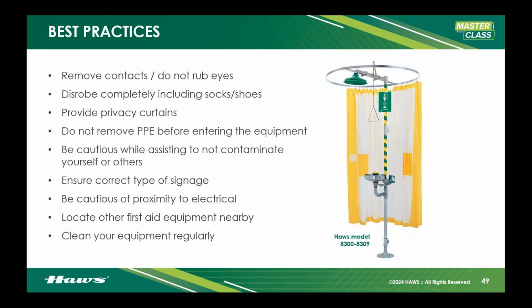Be cautious of proximity to electrical. Okay, maybe don't put the electrical outlet next to the shower. It'd be your last shower. Locate other first aid equipment nearby and then clean your equipment regularly, please.